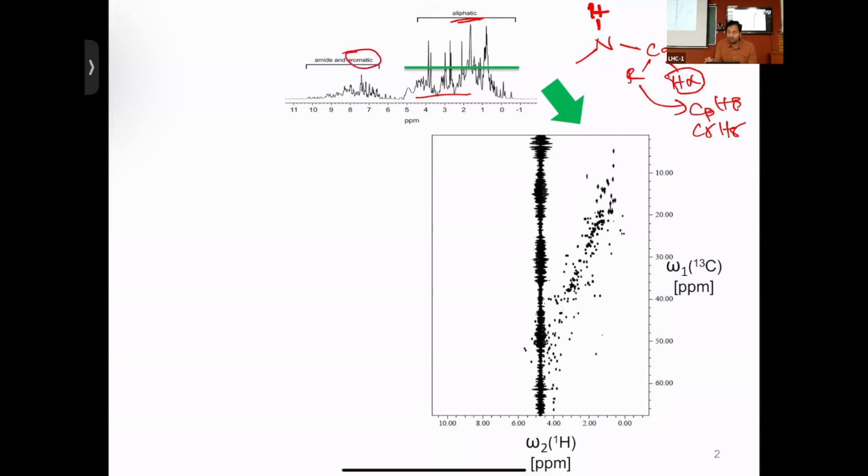Some of the aromatic ones come here, but there is phenylalanine, there is tyrosine, there is tryptophan, all of which are aromatic. Even histidine can be characterized at some point as aromatic, meaning that all the resonances come in that region. And you have many of these within the protein, making the resolution not good enough from a proton 1D to study. So at this point, what we start to exploit is that instead of just getting the proton chemical shift, we actually correlate the carbon chemical shift to the proton. Wherever you have a carbon-proton one-bond that exists and the carbon is 13C, you will be able to correlate the proton chemical shift and the carbon chemical shift. We'll see how we execute it later on.